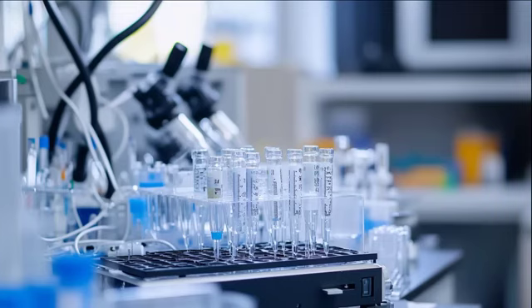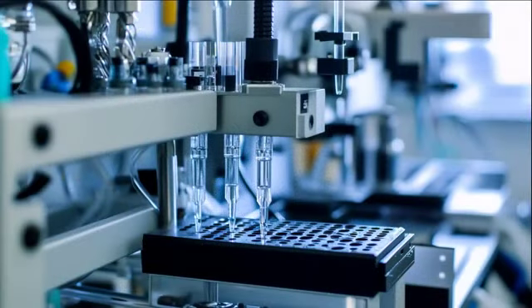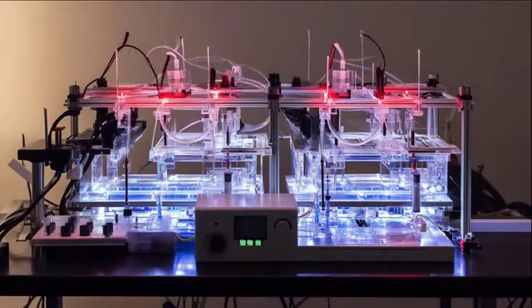Micro-total analysis systems, MTAS, represent the convergence of all laboratory functions on a single chip, enabling complete chemical analysis from sample to result. For instance, an MTAS device can extract, amplify, and detect genetic material from a sample, much like a miniaturized laboratory performing the entire workflow within a single integrated system.